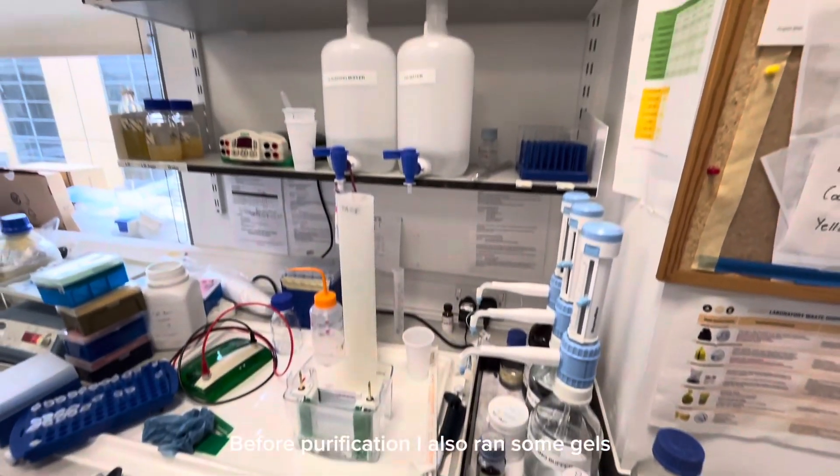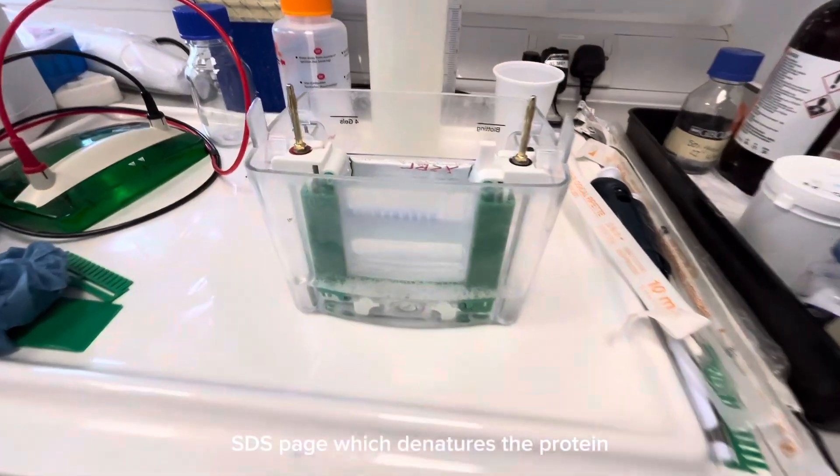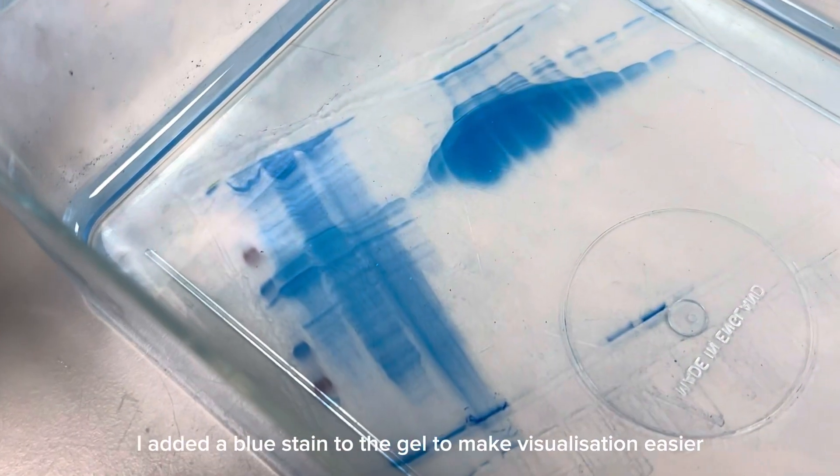Before the purification I also ran some gels to confirm whether the protein was present. This is SDS-PAGE, which denatures the protein, and I also add a blue stain to the gel which makes visualization easier.